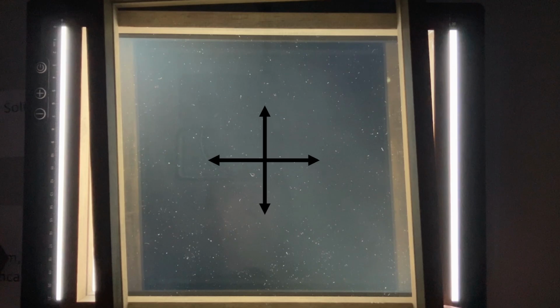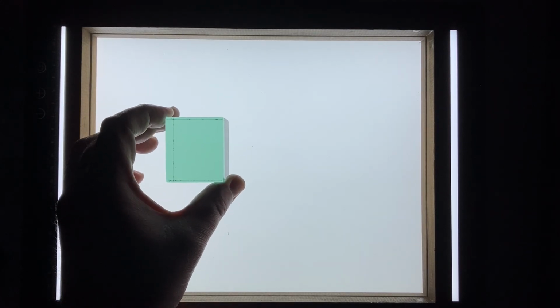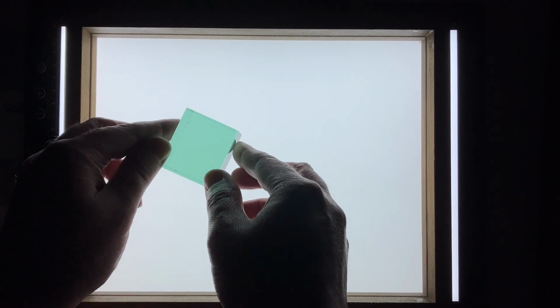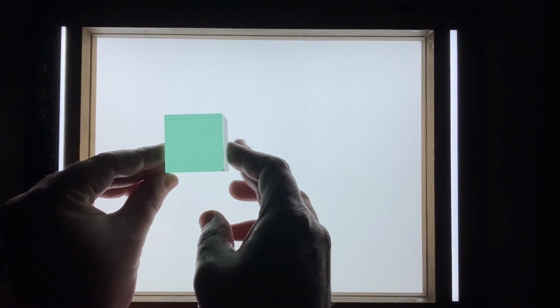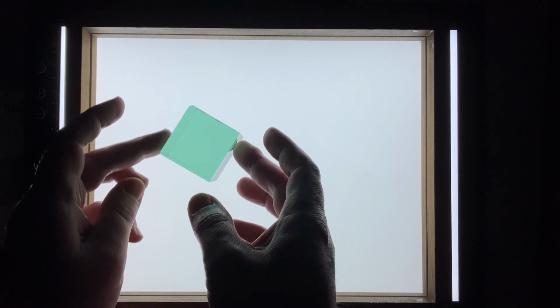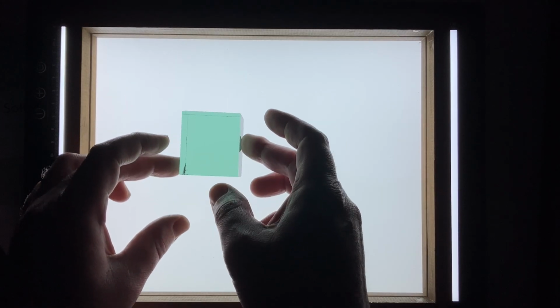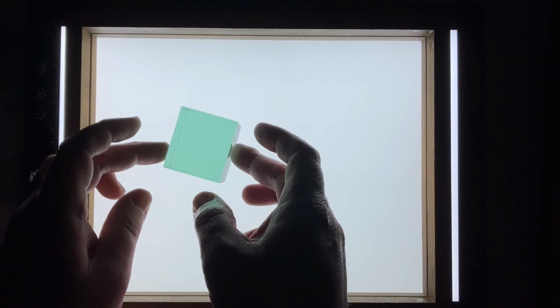Let's bring in our cullet glass sample and examine it with plane polarized light to start. We won't need our upper polarizer for this first experiment, and we're now viewing how plane polarized light interacts with our cullet glass specimen. The phenomenon of pleochroism would occur as a change in color as I rotate our specimen here in a bunch of different viewing directions. And you'll notice for our glass, not really much of anything happens. Our glass specimen does not display pleochroism, and the behavior it displays is the same in all directions through our glass sample.